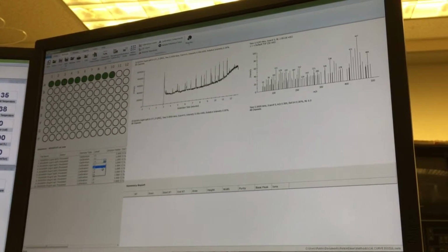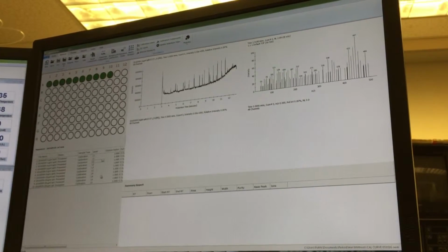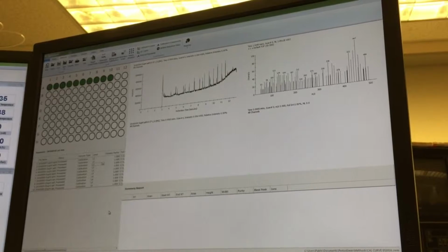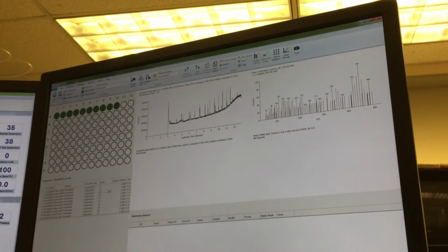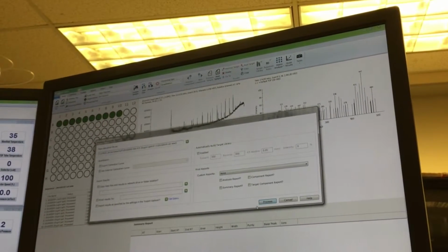So it depends on which concentration you are using. For 2, choose 2. For 5, choose 3. For 10, choose 4. For 20, choose 5. Whatever number you give for a concentration, you have to choose that name. Yeah, this is important. Then go to home, analyze. Process.